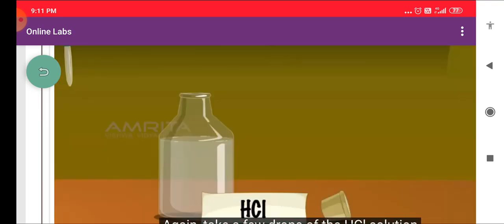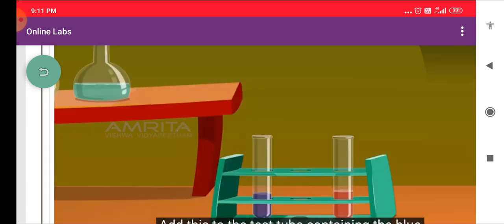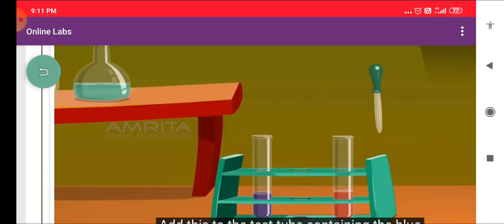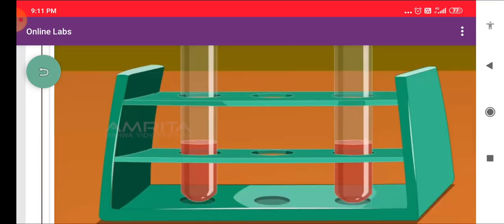Add this to the test tube containing the Red Litmus Solution — the color of the solution remains the same. Take a few drops of HCL Solution and add this to the test tube containing the Blue Litmus Solution. Note the change in color: the color of the solution changes from Blue to Red. HCL is an acid with a pH value below 7.